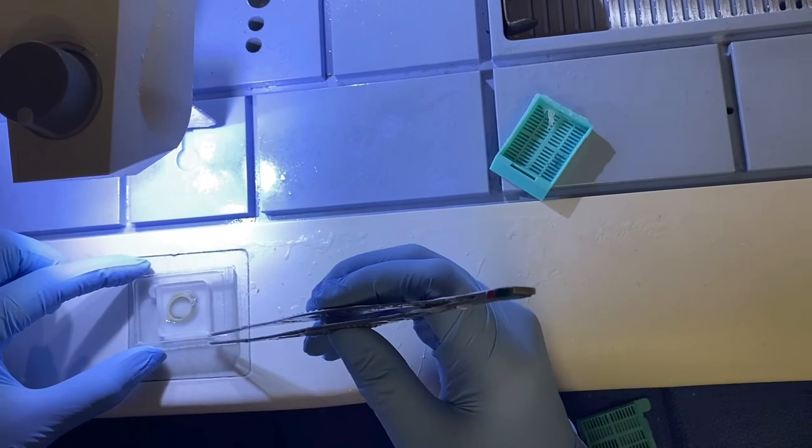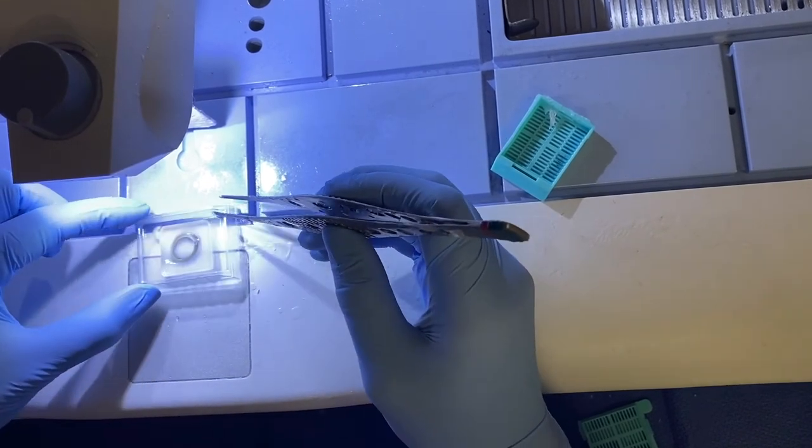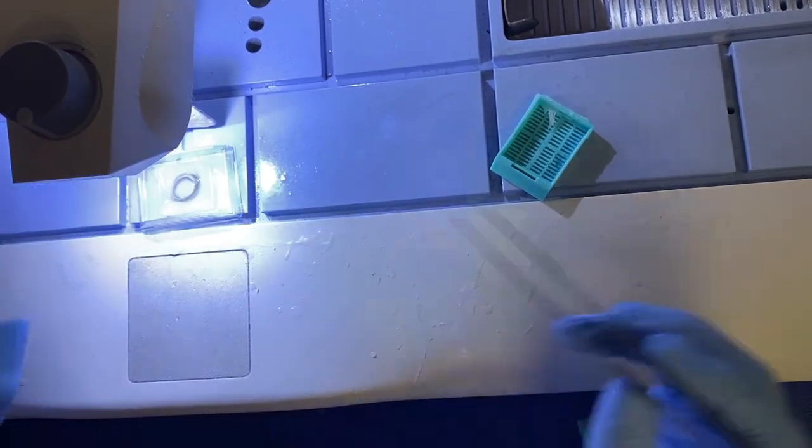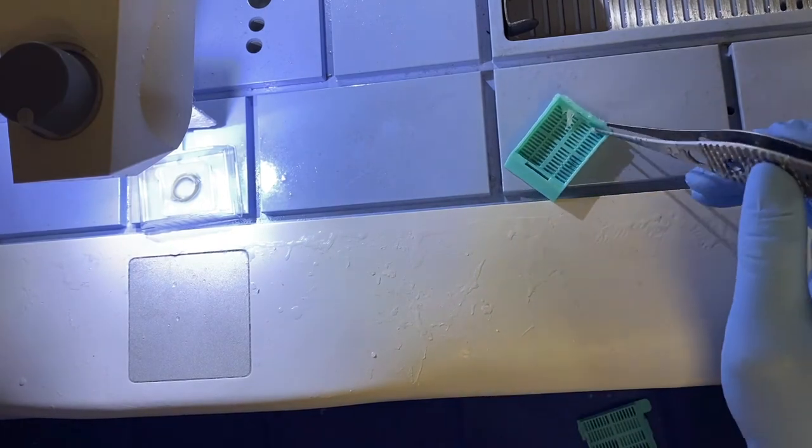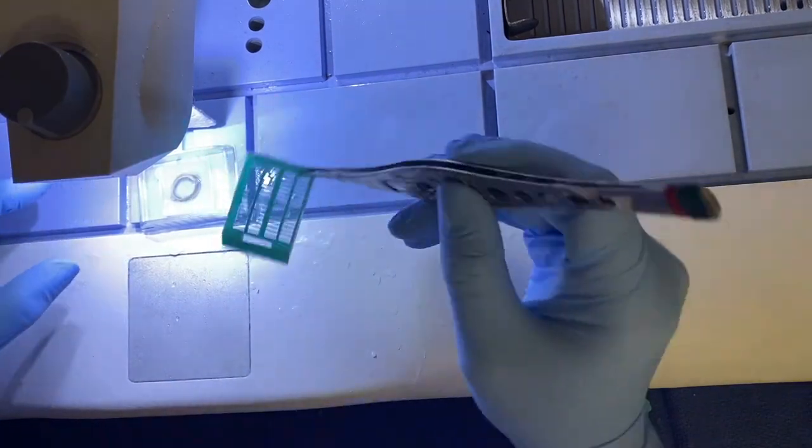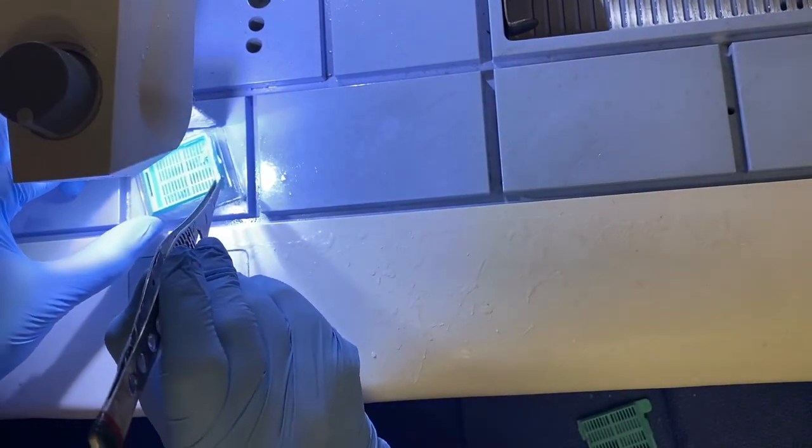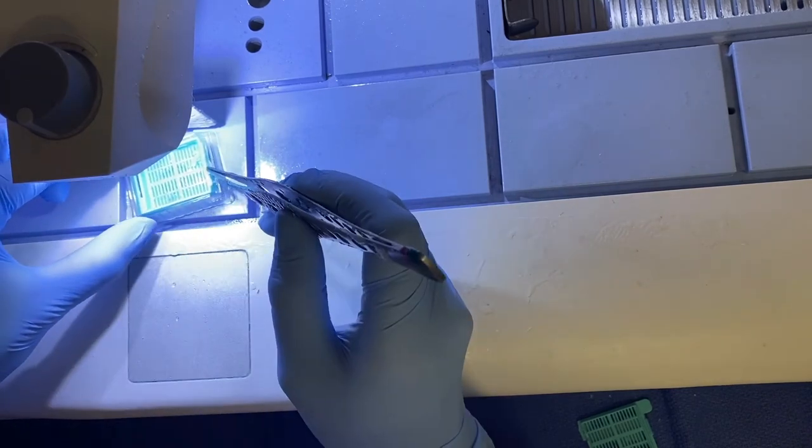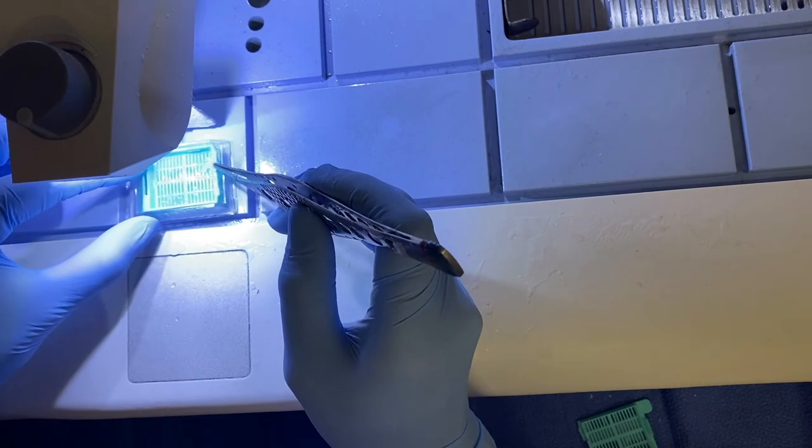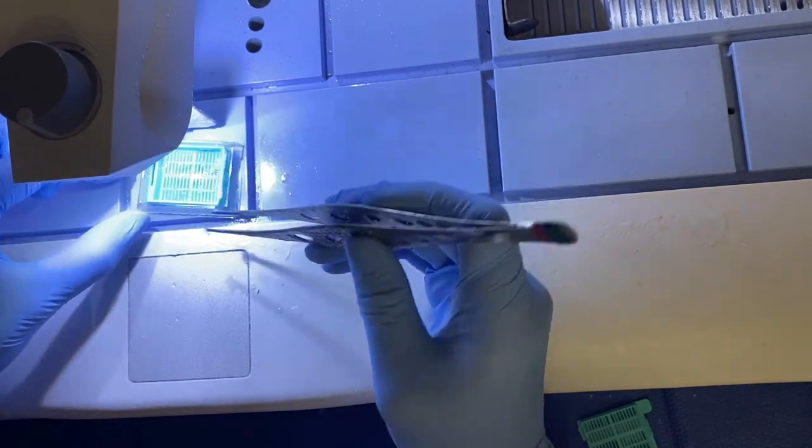Then we're going to move it back, take our cassette, and put it on the top. Again, we want to verify that we have the correct patient identifiers showing here. Push it down into the mold—it fits perfectly and kind of locks in place.